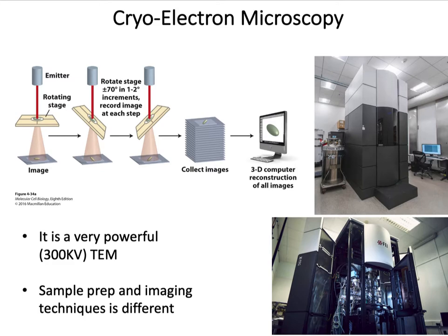So what is vitreous ice? When water forms ice by normal cooling, it forms a crystal-like lattice, and any living sample with water will be destroyed by these sharp crystal edges. But a rapid cryocooling method does not allow the crystal lattice of ice to form, and it forms a glass-like amorphous ice, or vitreous ice, which preserves the specimen entirely in its original form.